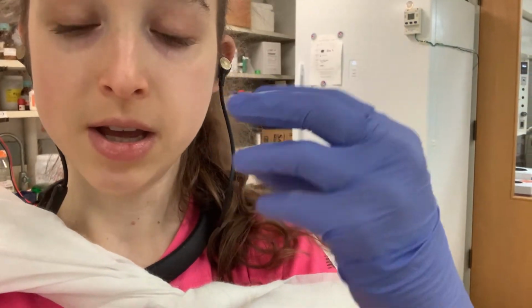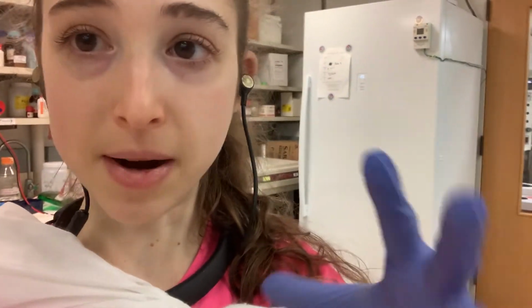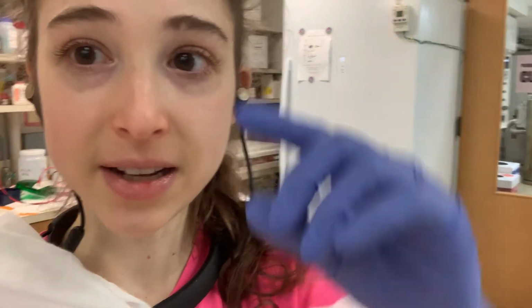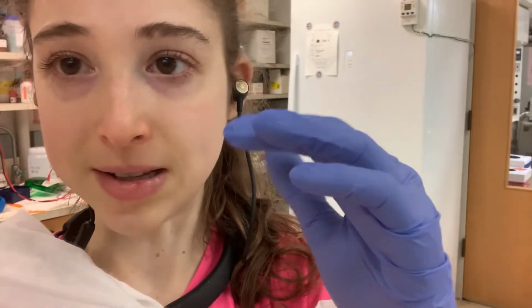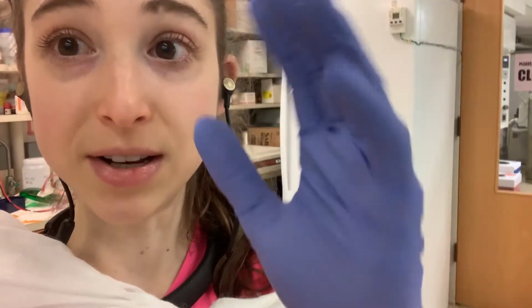When you're getting to the right pH, if you're in the buffering region, you'll feel like you're adding oodles and oodles of your acid or your base and it's barely changing. This is because you're in the buffering region. But getting to the buffering region, the changes will be a lot faster, because you're not buffering, so you're going to wildly change the pH. And if you're on the edge of the buffering region, you can easily switch into and out of it. So you need to be careful about that.